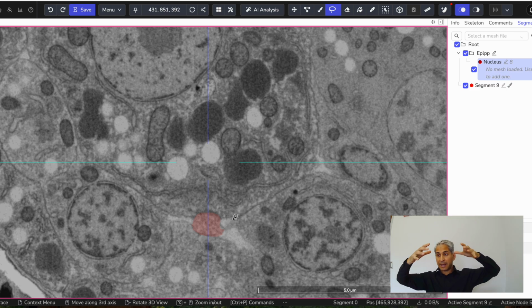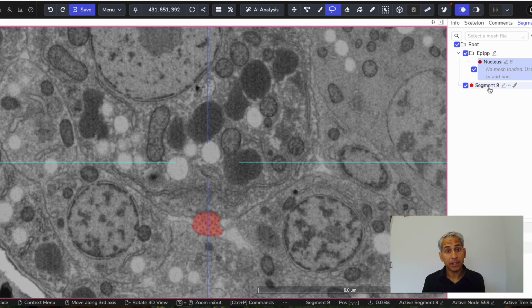And then it's going to expand as I go down, and then it's going to become small again, in most cases. Some of you have cells that sort of twist and turn. You're going to have to chase it. But start from a spot that is as small as possible and that you're 95% confident is the beginning of your cell. And then trace it.